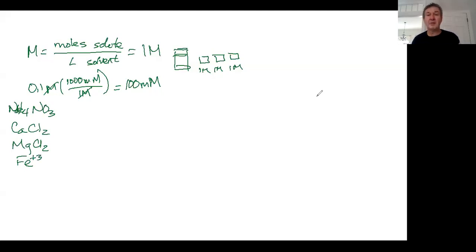All these things that allow plants to grow. We have a raft of potential ionic materials that could be put in. The first thing we're going to do is take ammonium nitrate, the top one there, and we're going to do a series of dilutions and see how conductivity is affected by it. And as you probably suspect, as the amount of particles goes down, the conductivity goes down relative to the number of particles.